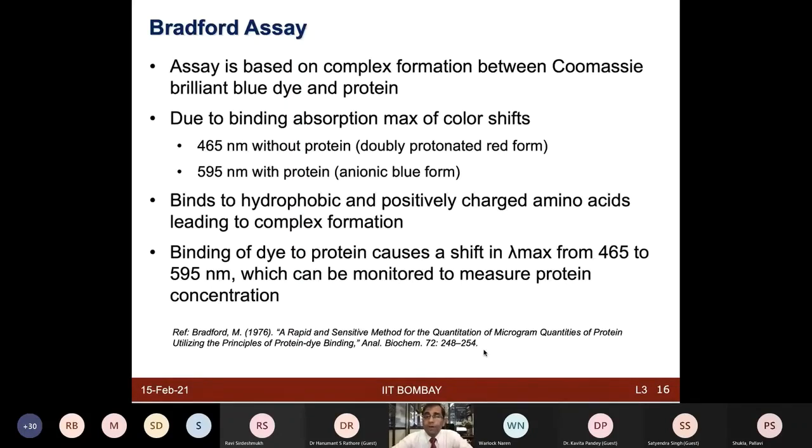You are using different types of assays for doing quantification. Please use that. There is no need to only shift to Bradford. I just want to convey one thing, that there is no quantification method which is the best method. You can choose the quantification method the way you think is working well for your lab. Could be the Lowry method, could be any other kit which you are using, the BCA method. Anything is actually good, and none of them are actually perfect, right?